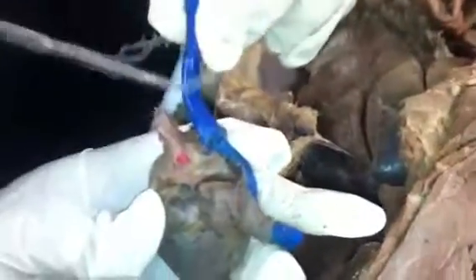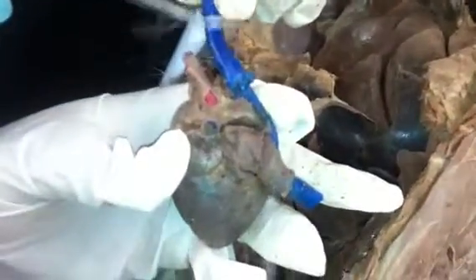Okay, the body of the stomach. This is the body, the fundus, and the pylorus. The fundus is located at the top of the stomach, and then it's the body, and then it's the pyloric, like the bottom of the stomach. Okay, the greater curvature is this thing. Right here, where we slit it to open the stomach, it's the greater curvature where it curves. The lesser. No, it doesn't have a lesser. Okay. The superior vena cava is right here. On the top. Yeah. The testes.